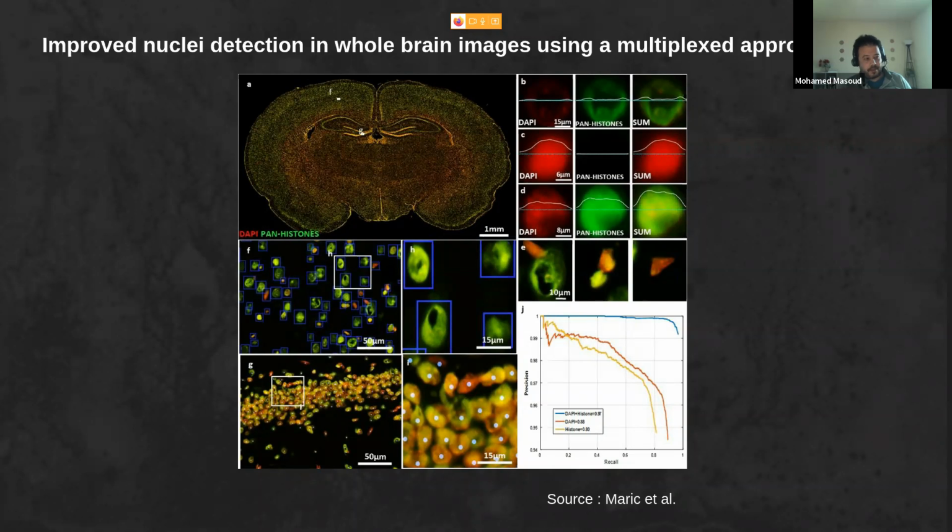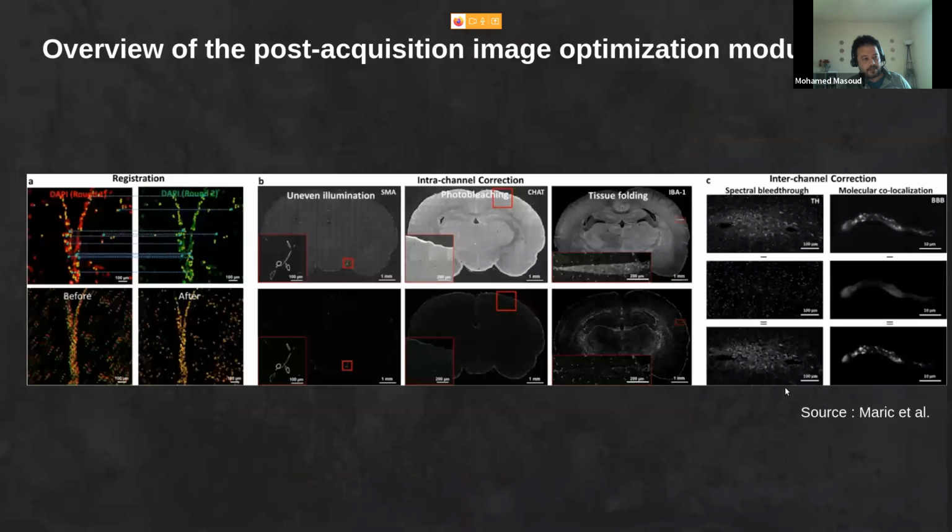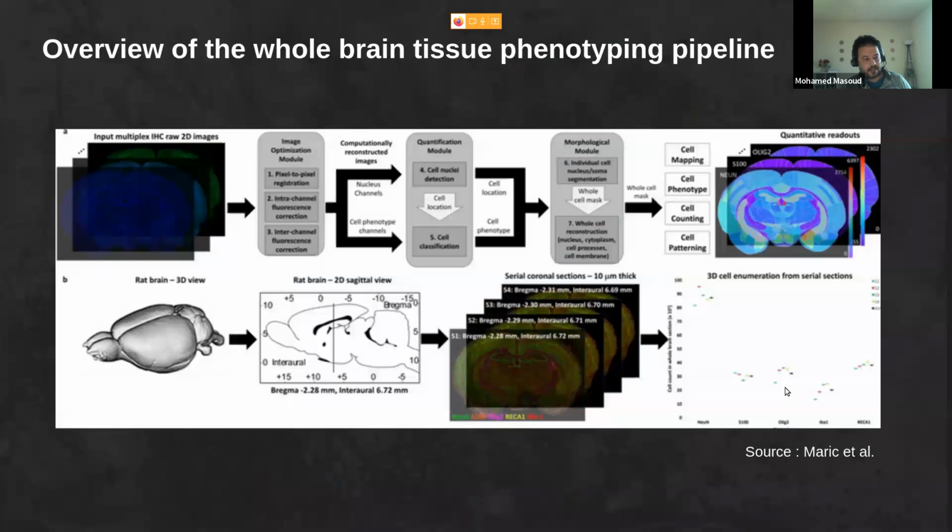Well, they make a 3D analysis, as we can see. I didn't see a reconstructed structure, but they have each slice from the brain, and they plot on a graph here, on the second row on the right, the cell counts for each slice.